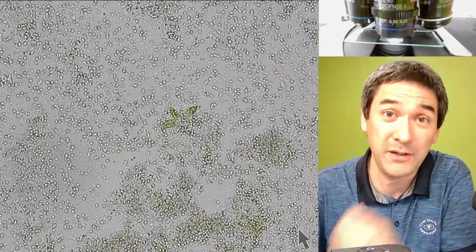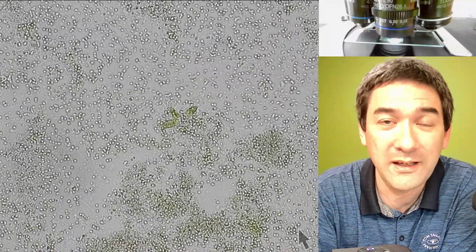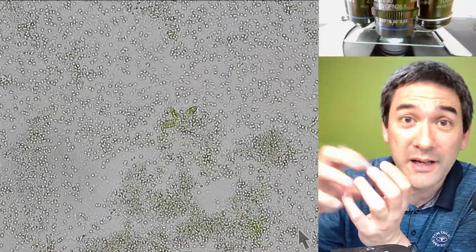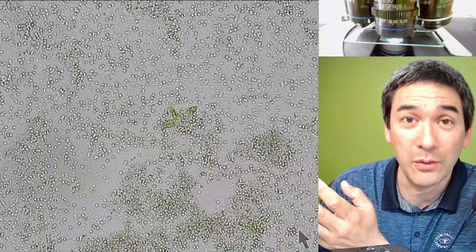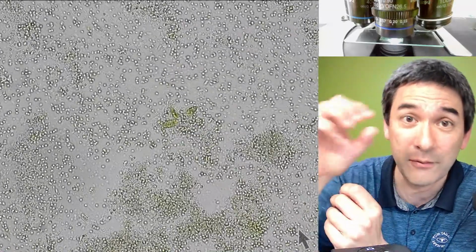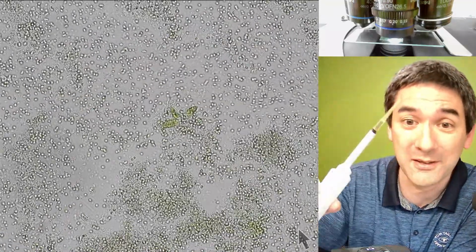For example, I mentioned it before, the tardigrades, right? If I show you a tardigrade moving along, it looks kind of nice. You don't see it like that in reality because the tardigrades are usually hidden behind some soil samples or some sand particles or some algae, and it's very messy, right? And if you want to get a nice video of them, you have to isolate them. So I've spent quite a bit of time transferring those tardigrades to a new slide using my pipette, right?